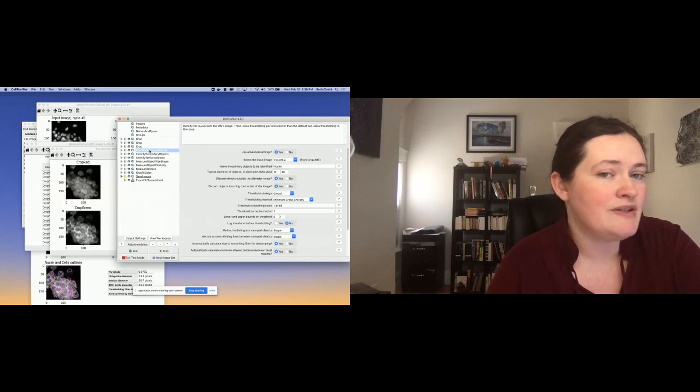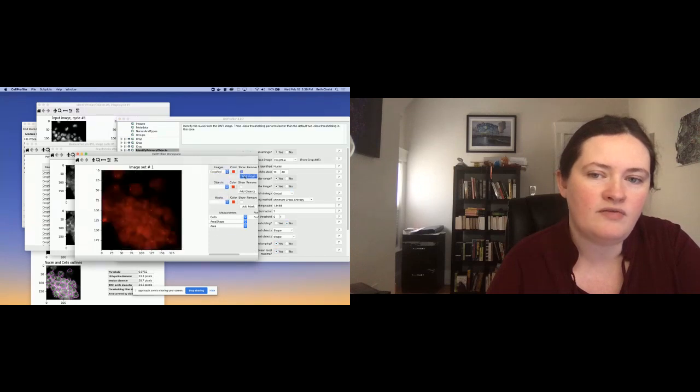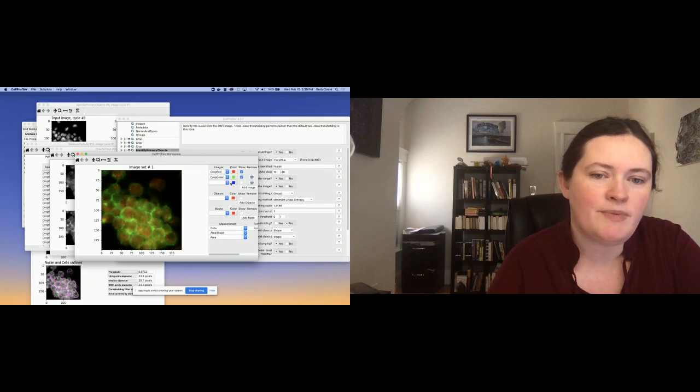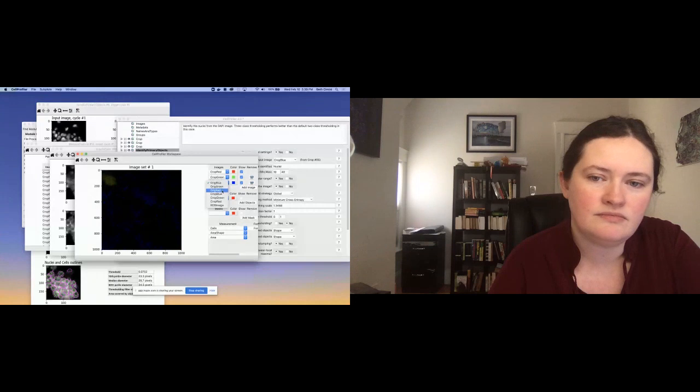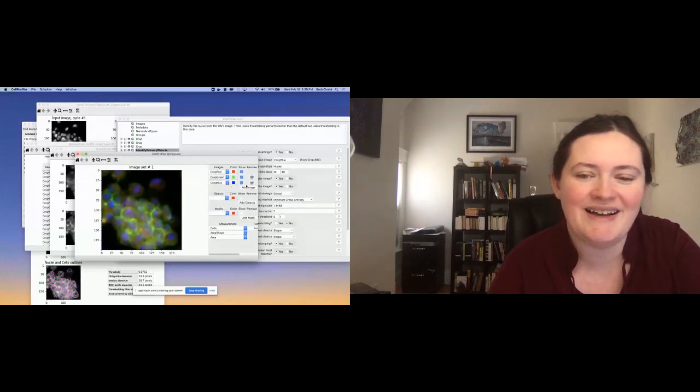Most of the time you spend in CellProfiler will be in adjusting your object finding. That's the really hard part. So we do also offer something called the workspace viewer, where I can load up all of my different images. And if you have, for example, a really tricky cell, you're having a hard time, it helps if I load either all cropped ones or all original ones.